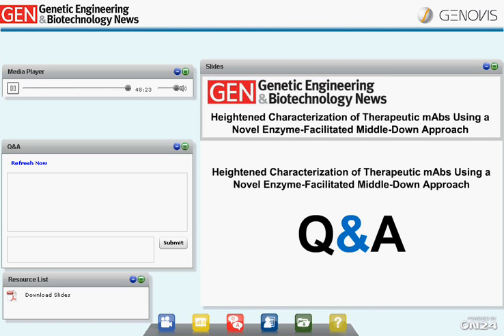Okay. Another quick question. Specificity, how does this work on IgG4s? Yeah, it works excellently. You will have the same specificity on IgG4 as you have on IgG1. I think there's actually a paper published on using the FabRICATOR enzyme on IgG4s. I just don't remember it off the top of my head, but I could probably get back to that in a minute.